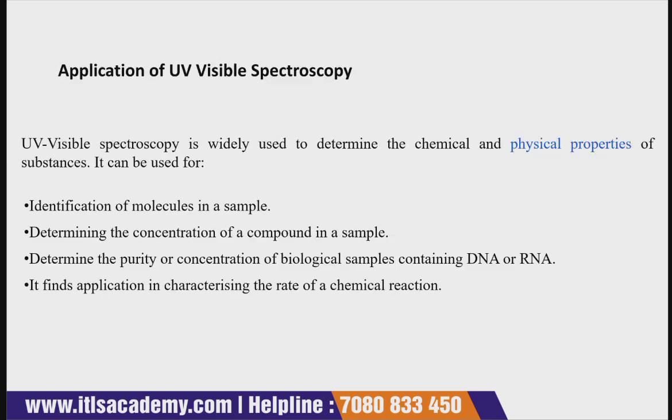Now after that, let us talk about the applications of this spectrophotometer.